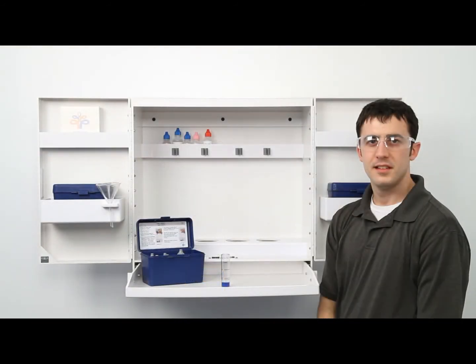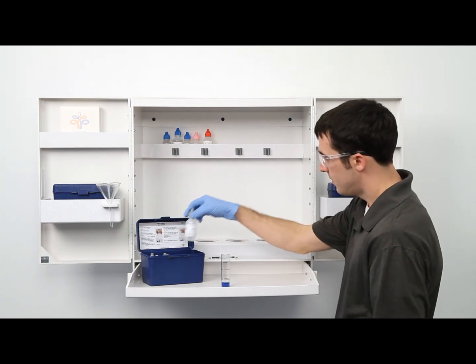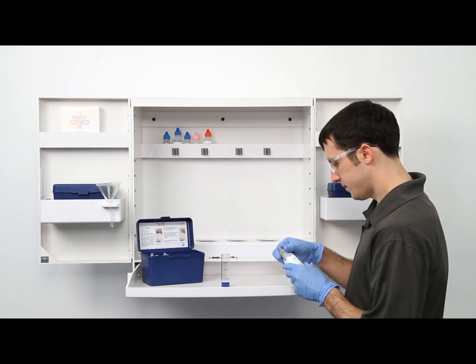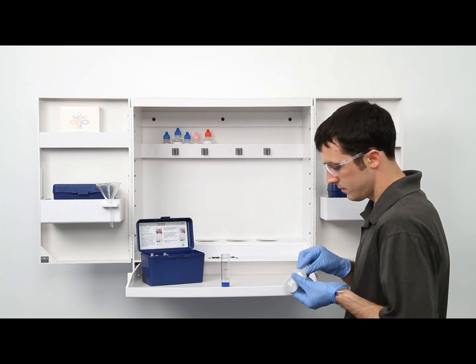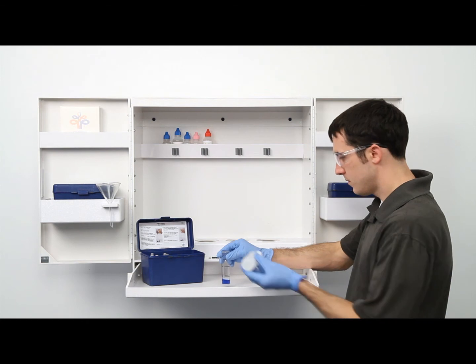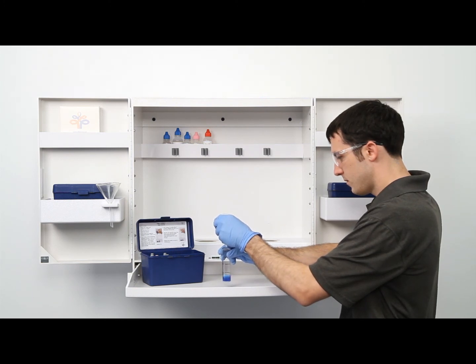The next step according to the endpoint ID procedure is to perform the titration. The bottle of titrant for the Quat test is labeled as QAC-DT. It's important to make sure you have the proper titrant and the proper sample size for this titration. Remember to hold the bottle vertically to make sure you get a consistent drop size.